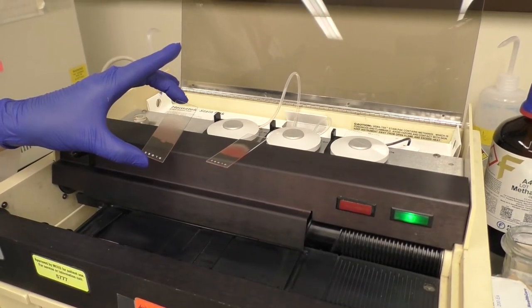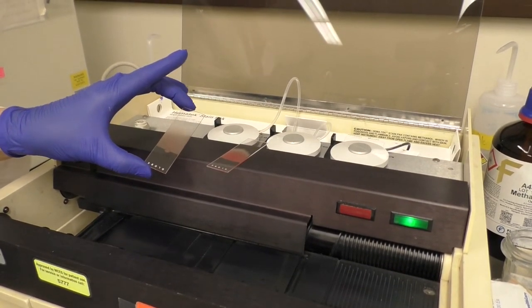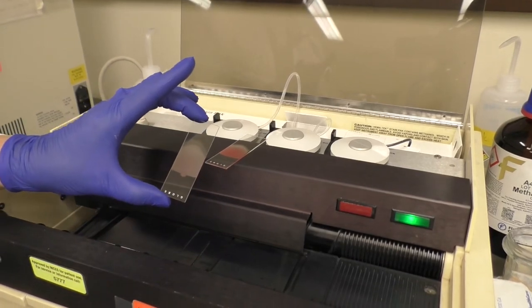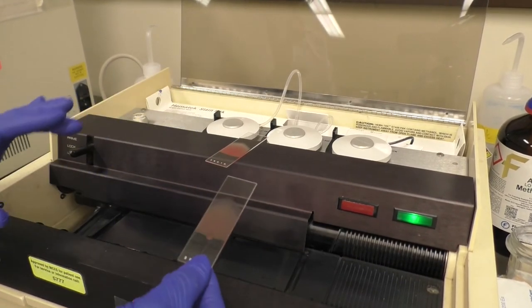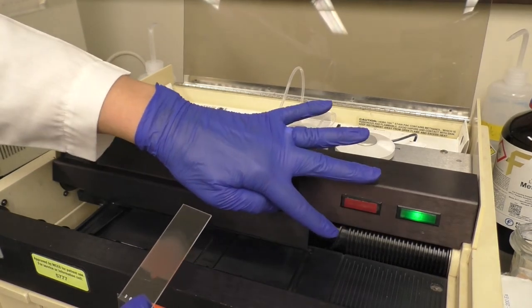First, place prepared slides for staining in the grooves of the conveyor spirals. Ensure the slide is properly aligned in two directly opposite grooves.